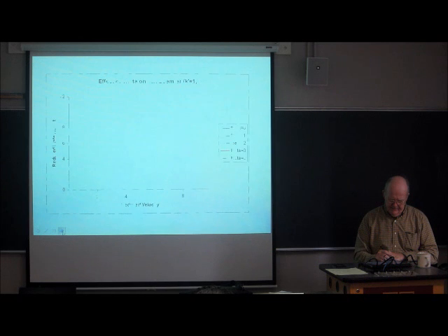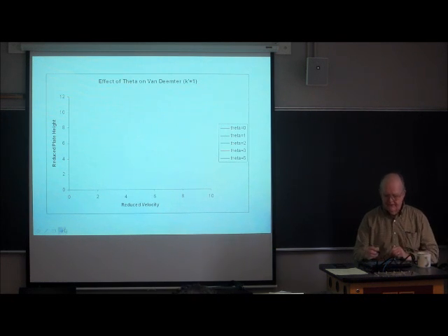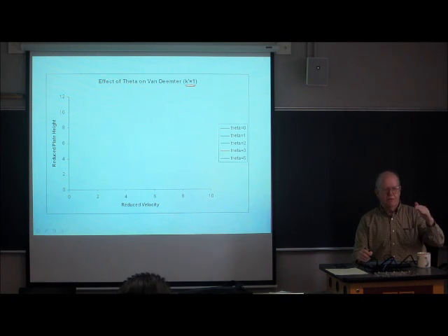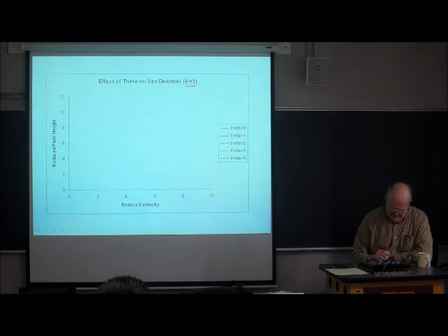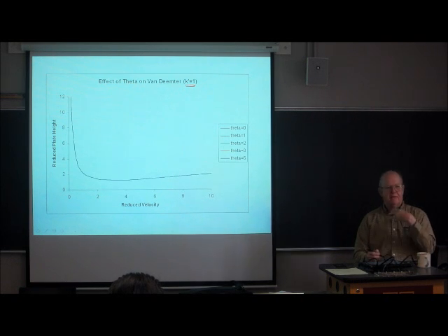Here's the flip side of that. I'm taking k prime equal to 1, and I'm going to start with equilibrium and then make it slower, slower, slower, slower. Or you could think of this as infinitely thin film progressing towards a thicker film as I make theta bigger. So there's the infinitely thin film.